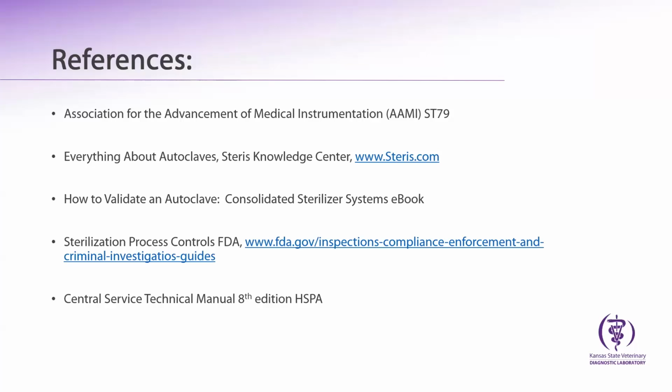This is what you would take and actually put into the middle of your rack or tray right over the drain, since that's the coldest spot. So this would go through the autoclave, through your cycle. You would take it out, let it sit 10 minutes. If that media in there is going to be hot, we don't want an explosion. It is fun to watch, though, I will say that, because I've actually seen that happen.